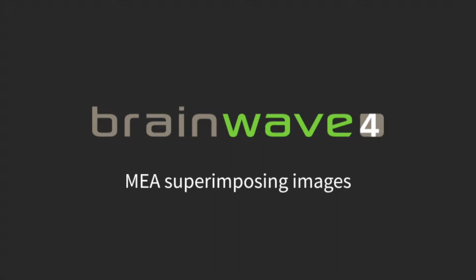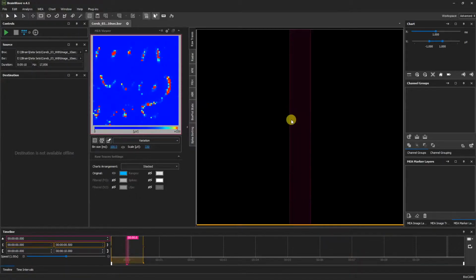MEA superimposing images. In Brainwave 4, we can superimpose images onto our MEA viewer to make it easier to localize the electrophysiological activity. Here we have opened a recording of a cerebellum slice and are using the Advanced Workspace.